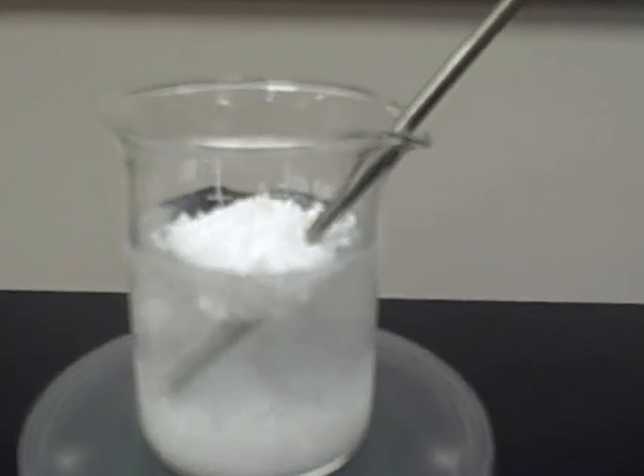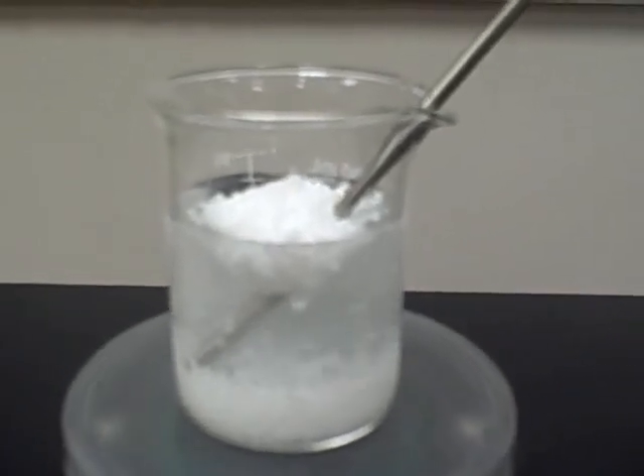Upon adding the ammonium nitrate and stirring, we can see a dramatic decrease in the temperature of the solution.